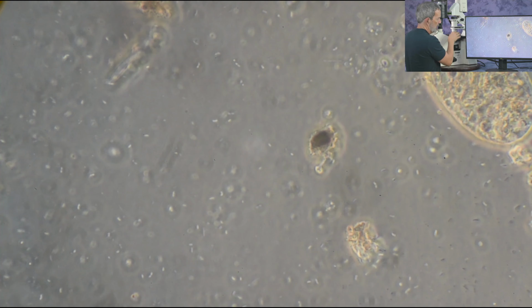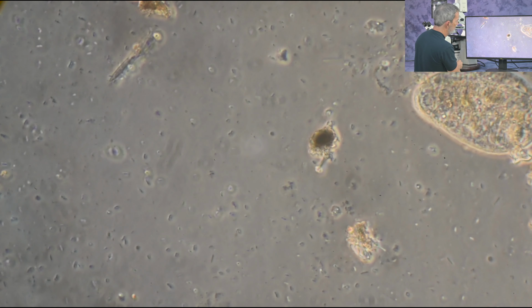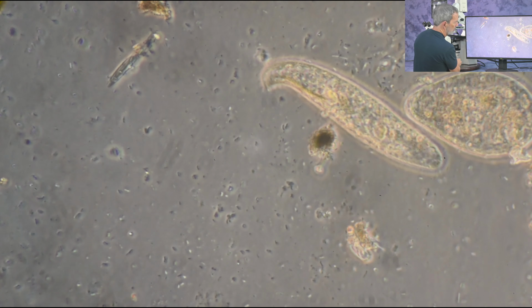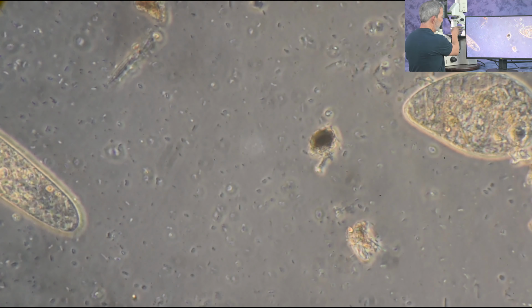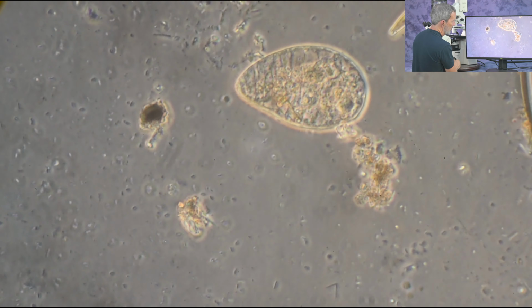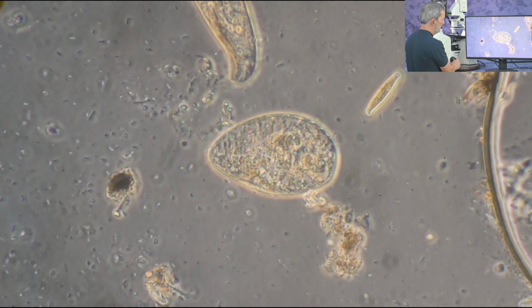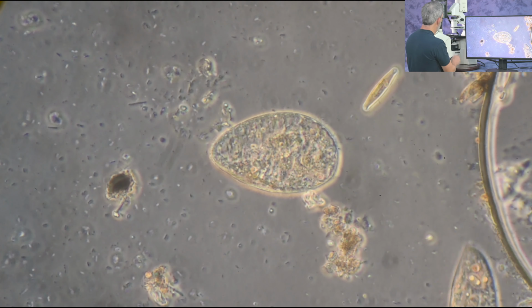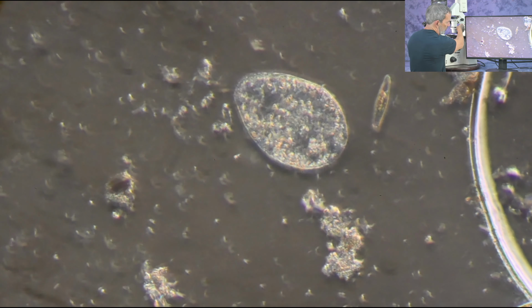Now that's a 20 power, let's go to a 40 power. Now on this one, this is a PH2. So it's only phase right now. Okay, I want to now switch it to the VAR, and this will take a VAR 2.